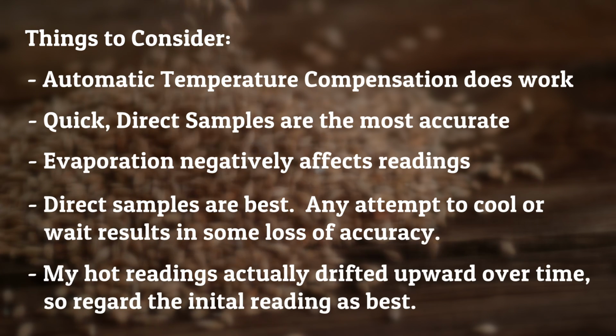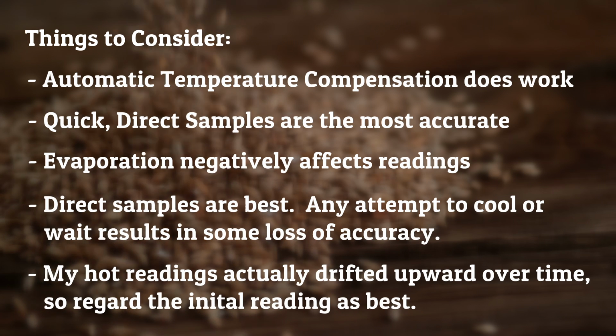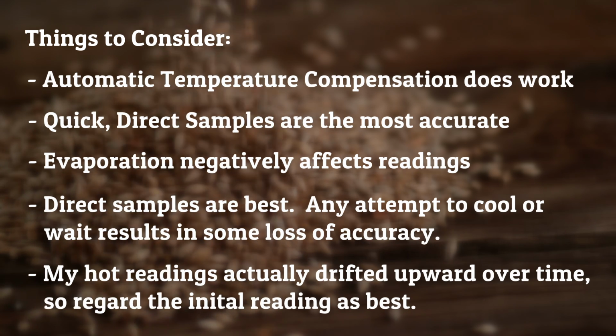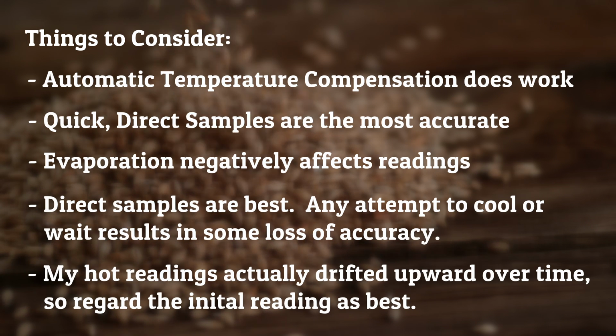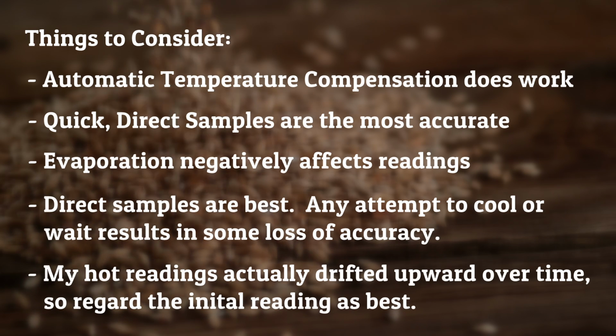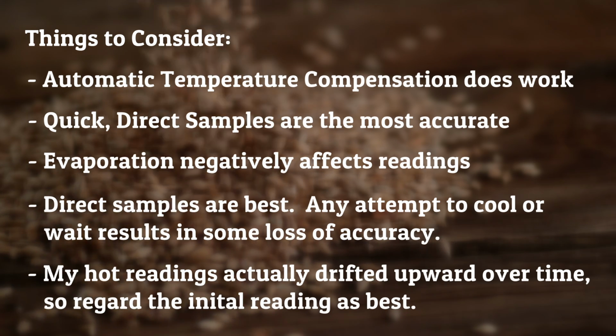My hot readings actually drifted upward over time, so it's probably better to put the most emphasis on your initial reading. So right as you put it on the platter and look into the refractometer, that first thing you see is probably going to be the most accurate, especially for the hot readings.